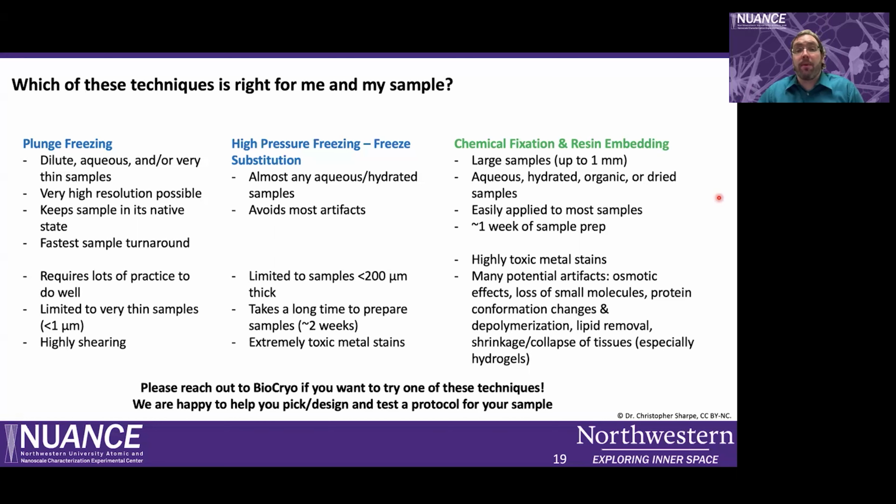Regardless of which technique you think might be best, we're very happy to work with you on any of them and to really help you pick and design and test a protocol for your sample. It is very much more art than science for a lot of these, where you will look at a particular protocol that has been shown to work for a particular sample that is similar to yours, and you'll try it and it won't work, and then you'll try a couple other things and find something else that works quite well. We have the advantage of having done this on a variety of samples, so we have a little more intuition on what things have worked for us before. That said, if you have a protocol you want to try, please do bring it by, and we're happy to work with you to implement it.